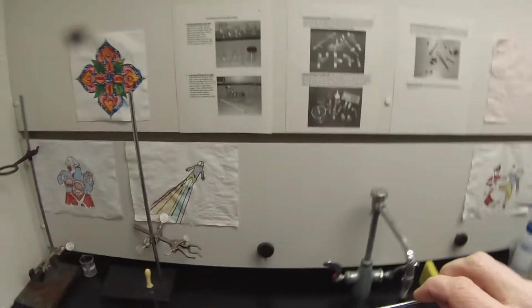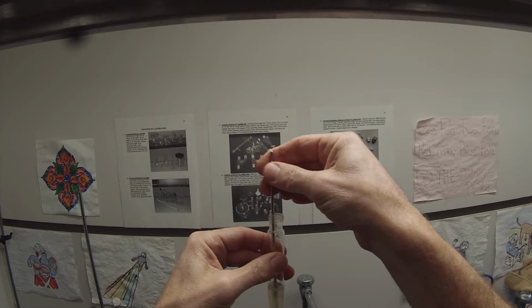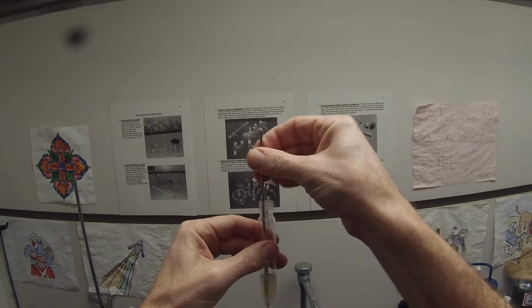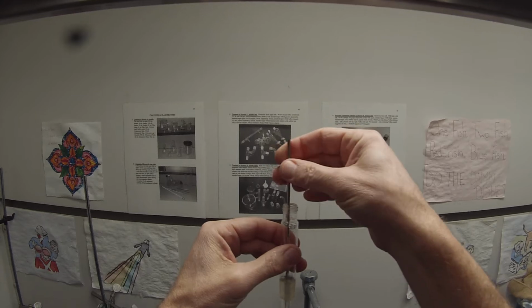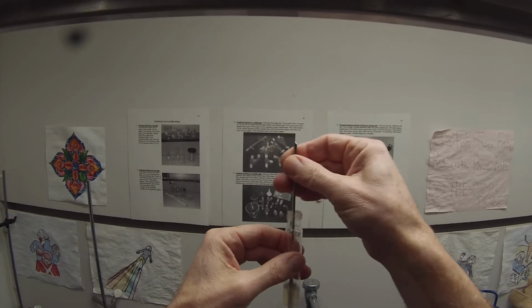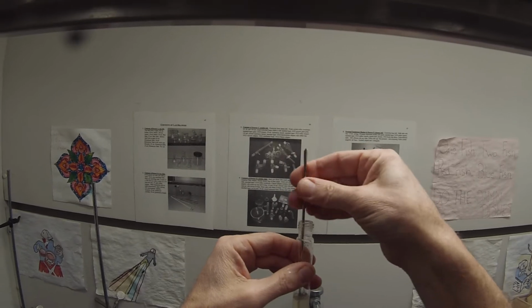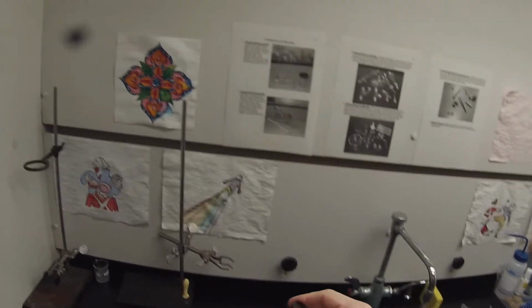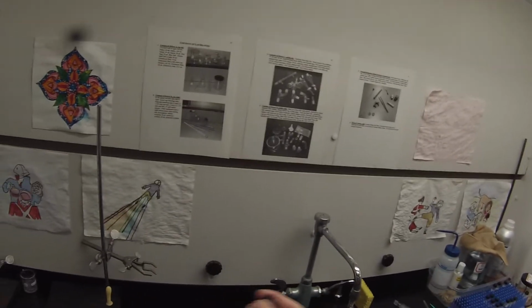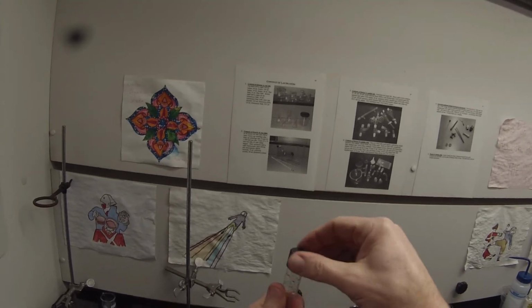Really shouldn't be much bubbling this time, because we should have gotten rid of almost all of the acid. But you can see there is still some CO2 generation, so we did not quench all of the acid with the 3 washes. That's a good sign. No hissing even on that first inversion this time. And we'll let that settle.